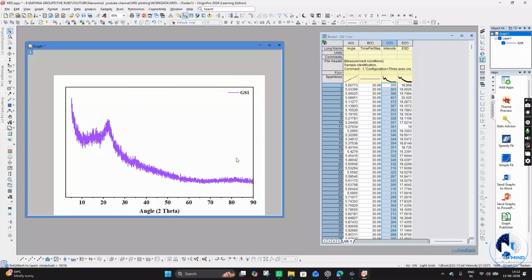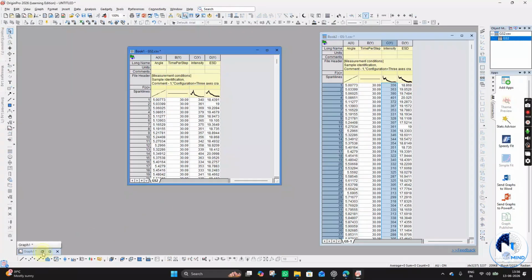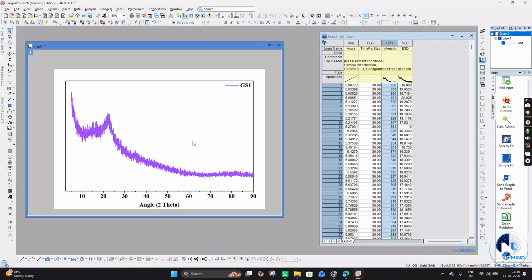So these are the things you must follow, and if you use different sizing, it will look very crazy. Like this is one size, this is another size, and that is another size. It's not professional. All the sizes should be the default. You must follow these steps. Like this, guys, we can plot more attractively. These are the defaults you must follow: the same sizing, and the box and plotting sizes. Always use it like this.